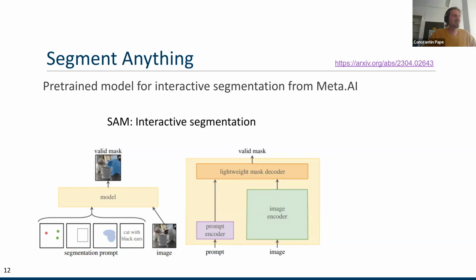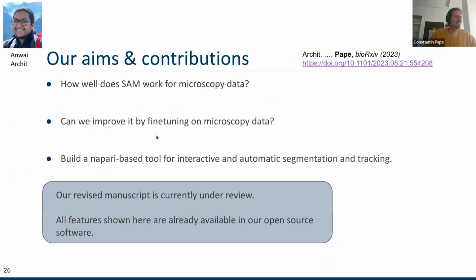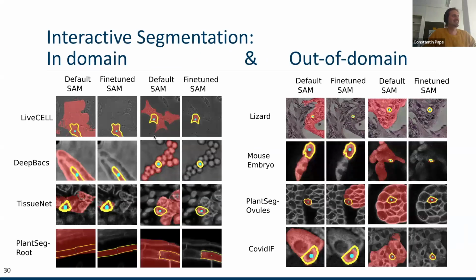We have a lot of datasets, and I always struggle a bit to show this, but here is what we call the mouse embryo dataset. These are 3D fluorescent nuclei, and we have a few, so that's worth trying. Then in napari, I would just load the 3D image and select automatic. Yes. Okay. Cool.